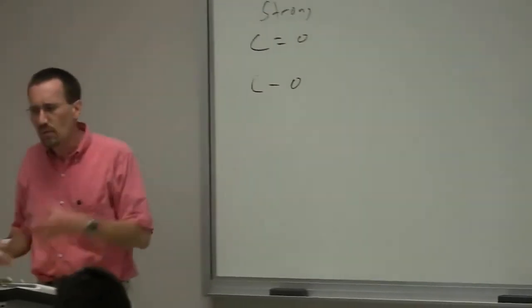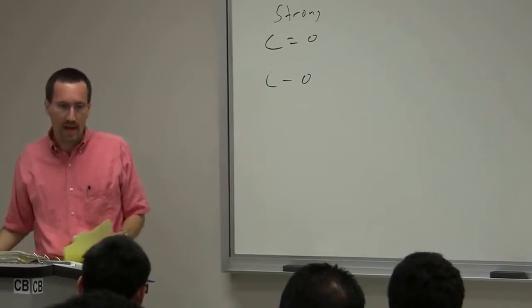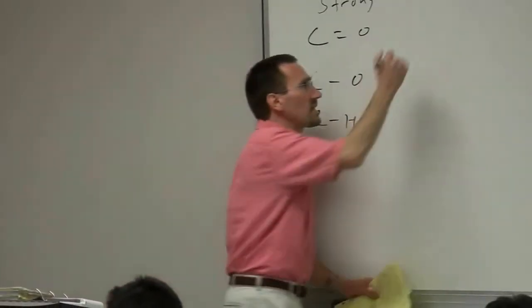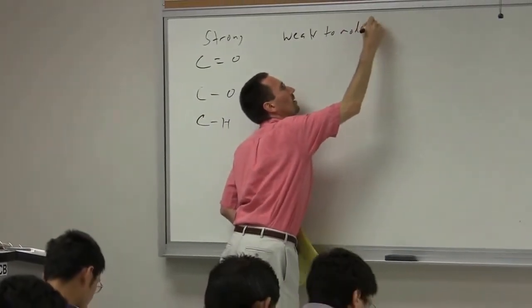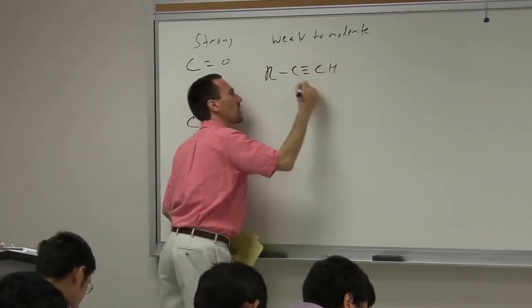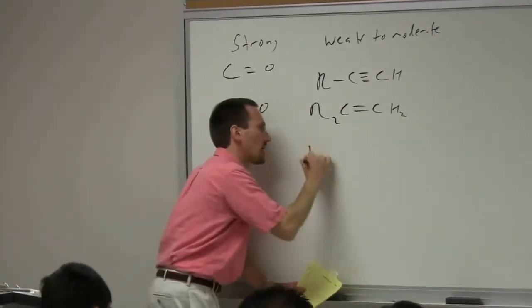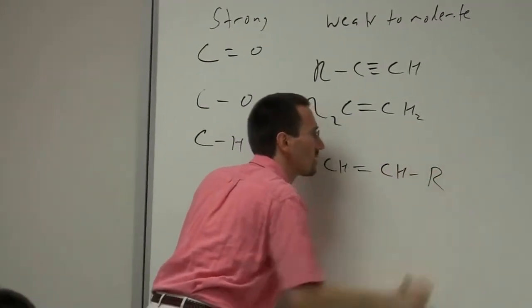Carbon-oxygen single bonds, anything with a big dipole moment in general, not always, but in general, has strong peaks. So anything where you have substantial differences in electronegativity between two groups. Peaks that are often weak or moderate are compounds like alkynes, carbon-carbon triple bond stretches, alkenes, carbon-carbon double bond stretches of various sorts, say terminal alkenes and internal alkenes.